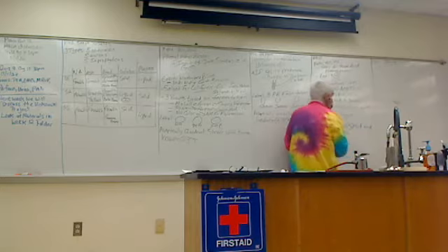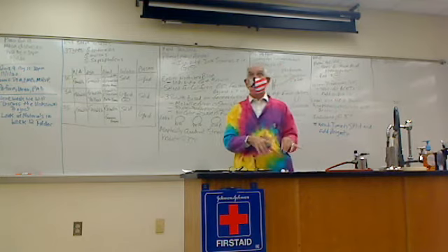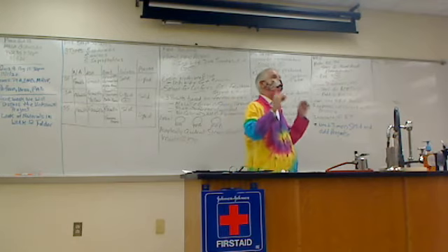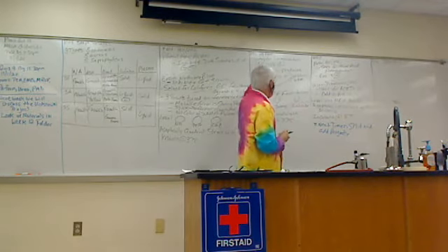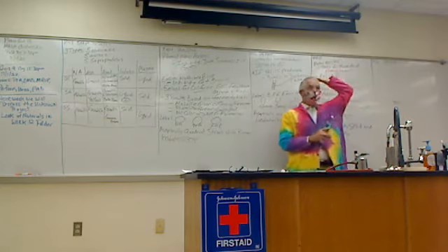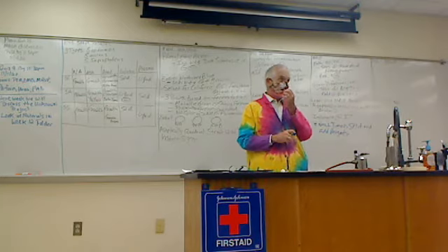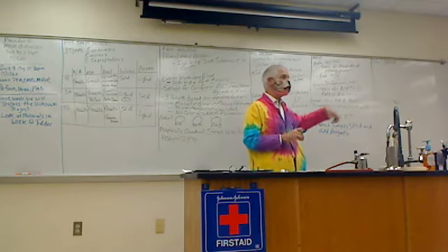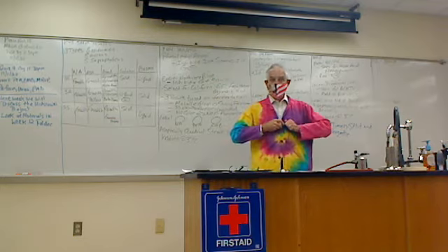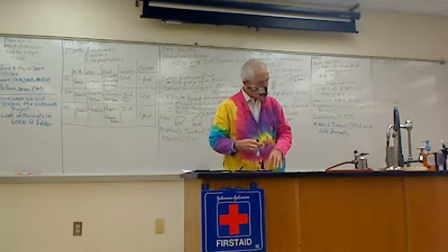So one of the things, again, please read the information in that handout and in your lab manual, guys, because for some of these you have to add reagents. Some of them, like this, and this one, they're going to do their thing without adding anything additional. But the MRVP and the PAD, you're going to have to add reagents to. Is that clear, everybody?